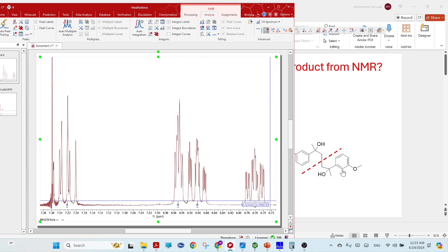So this peak, actually this hydrogen, has a metaproton here and also a metaproton here. That metaproton is splitting this proton again, that's why it is splitting multiple times. So this is that proton, and this proton has one neighbor directly, so it should show as a doublet, and then it has one metaproton and another metaproton, like 1, 2, 3, so it will split again as a triplet, so a doublet of triplet.